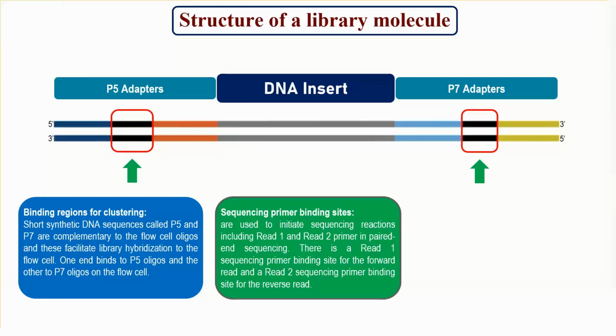A single read library would only be read in the forward direction, and a paired end library would be read in both forward and reverse directions to increase coverage.